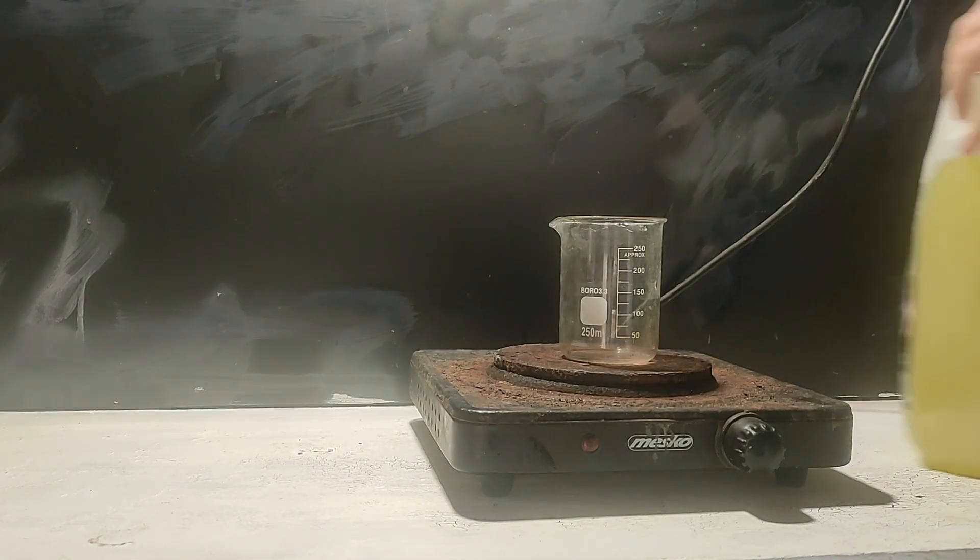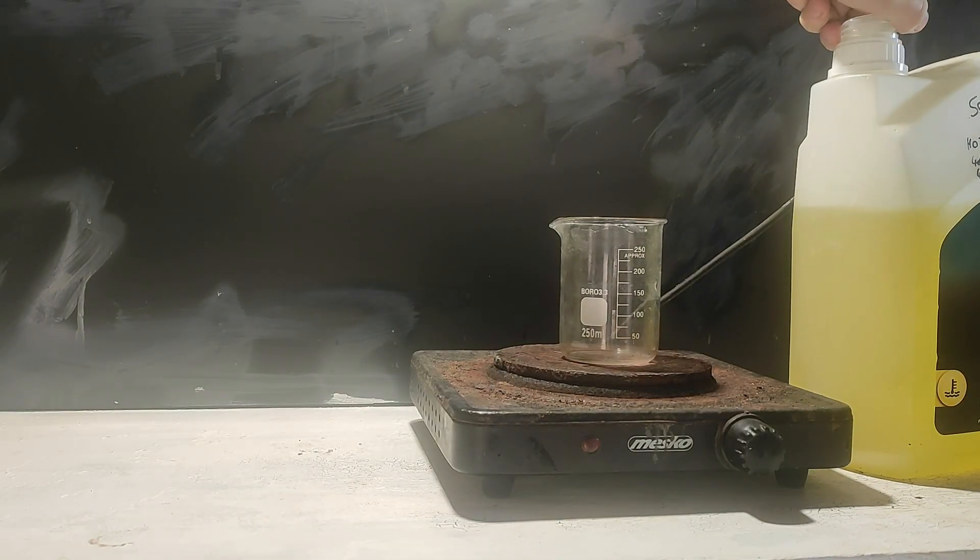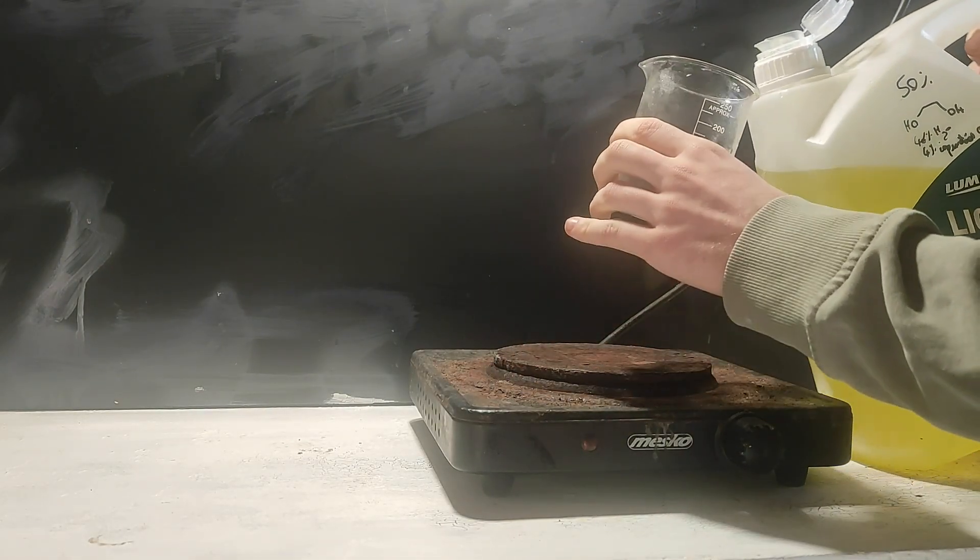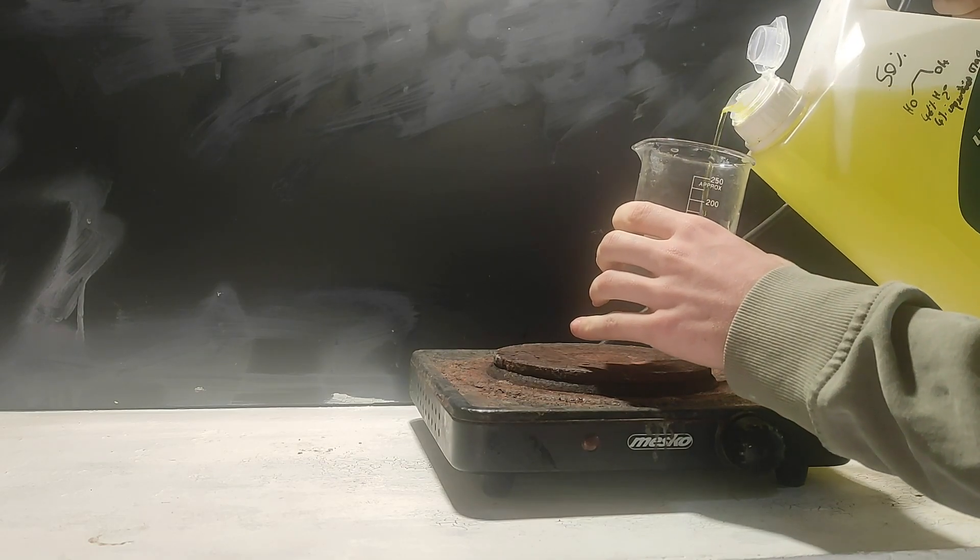Thankfully, ethylene glycol has a very high boiling point of 197 degrees, which means I can boil off the water and alcohol to be left with mostly ethylene glycol. So I set up the hot plate with the beaker and start to heat.